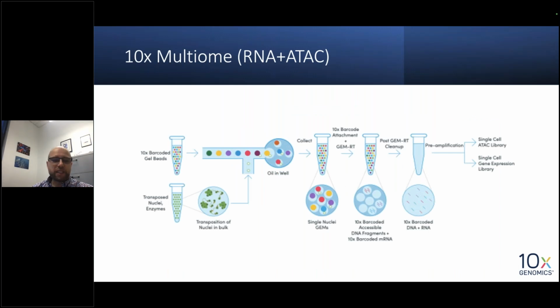How are these experiments done? We prepare our nuclei. The transposition reaction is done before loading on the 10x Chromium controller.